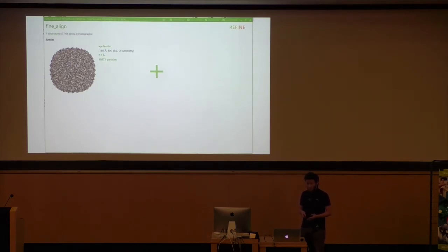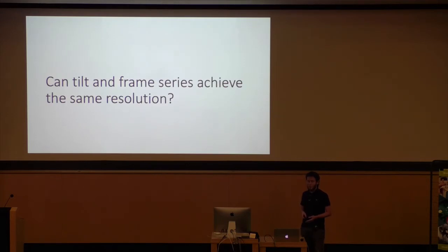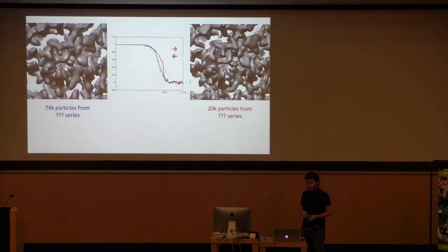And so, since this is data type agnostic, I was very curious whether 2D data refinement does better or worse than tilt series refinement. So I asked our facility manager, Christian, who's also here today, to collect two nice small data sets of our Lord and Savior, the apoferritin, and process them independently with Warp and RELION, and in the case of tilt series also with M, and got these two results.